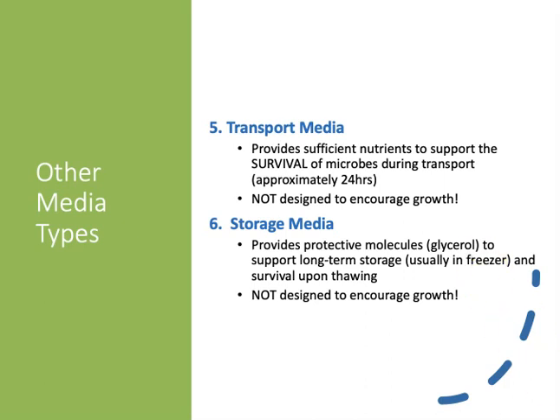We often use storage media to freeze microbial cells at minus 80 degrees Celsius, which is a very cold temperature. We can keep microbial cells for an unlimited period of time, really. And when we thaw them, they'll still be viable. Now, just like transport media, storage media is not designed to encourage growth. We're just going to help keep the cells alive through the freezing process.